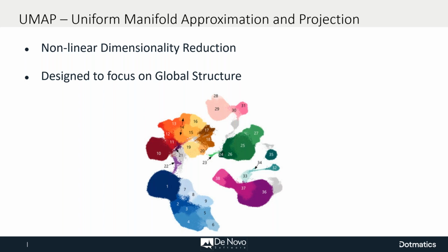So we'll talk a little bit about what these algorithms are, and then the good places to start in high dimensional analysis. The tagline for this presentation is basically we'll be talking about the specific settings and what they do, or some of the things that have the most impact on these algorithms, and how you can learn to change these settings to get a better result.